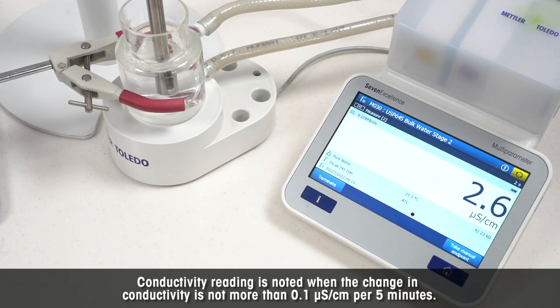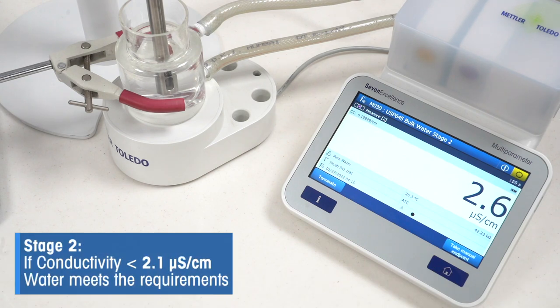Note down the conductivity when the change in conductivity is not more than 0.1 microsiemens per centimeter per five minutes. Hence, continuous monitoring of the sample reading is required. If the final conductivity value is less than 2.1 microsiemens per centimeter, the water meets the requirements as per stage two. Here, the conductivity value exceeds 2.1 microsiemens per centimeter. So we need to proceed with stage three.